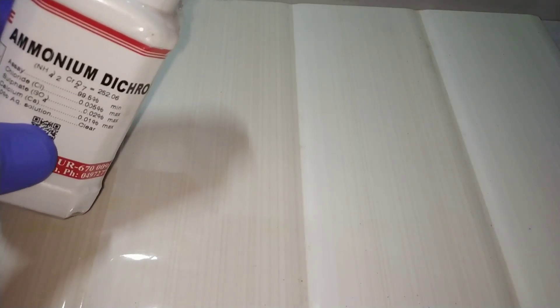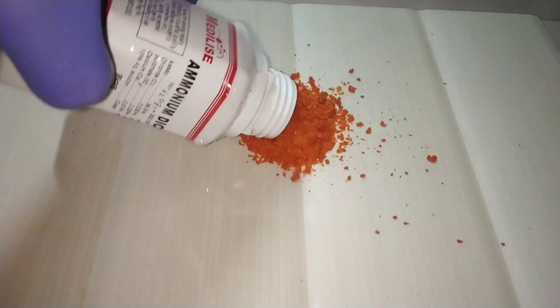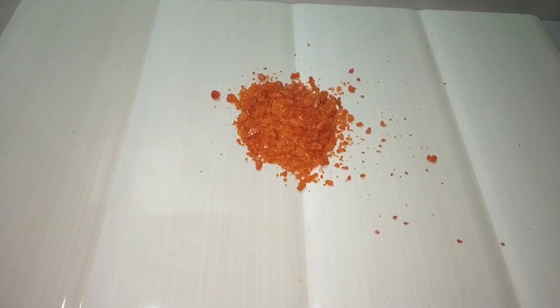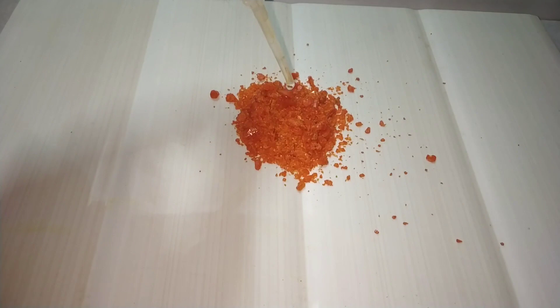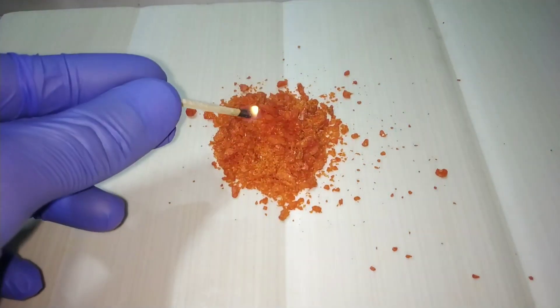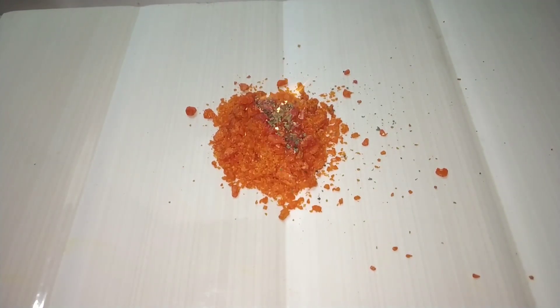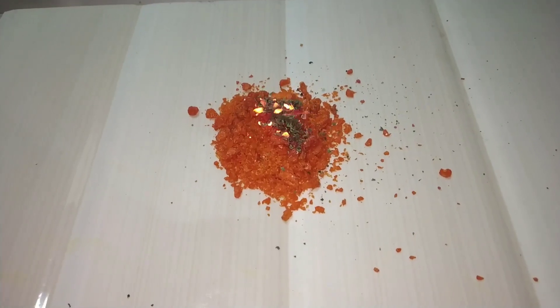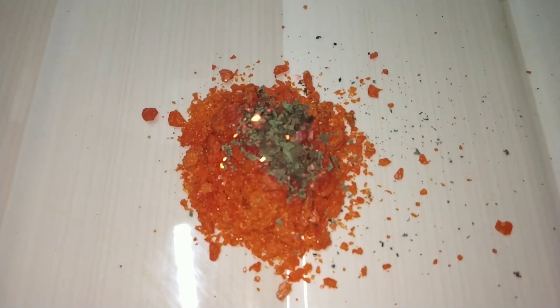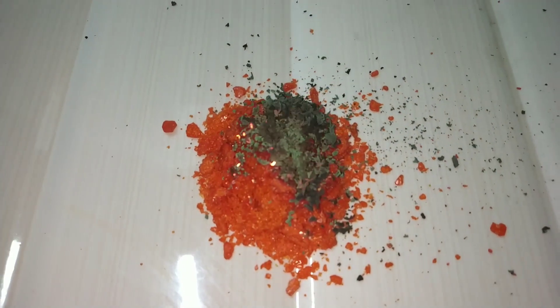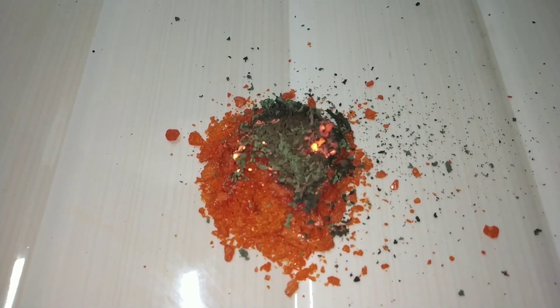Now let us see the thermal decomposition of ammonium dichromate. Here I have heaped up some ammonium dichromate crystals on this piece of tile and I am adding some ethanol over it so that it can burn easily. Now let us burn the ammonium dichromate. The reaction starts off by giving orange colored sparks and throws green colored chromium 3 oxide into air. This produces a miniature volcano like effect.